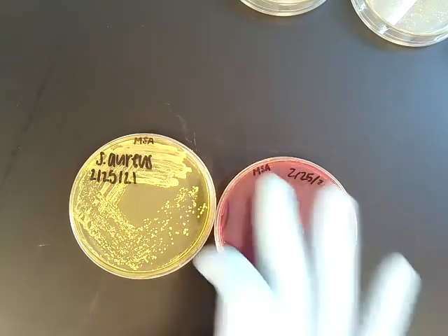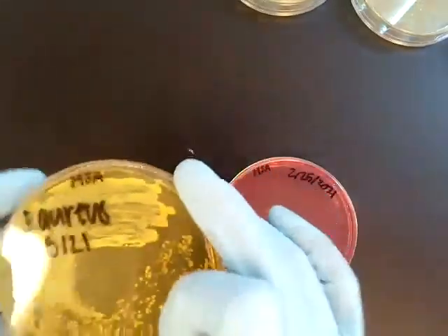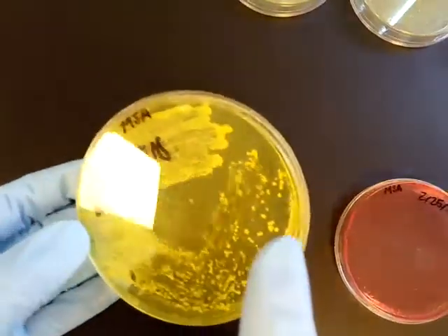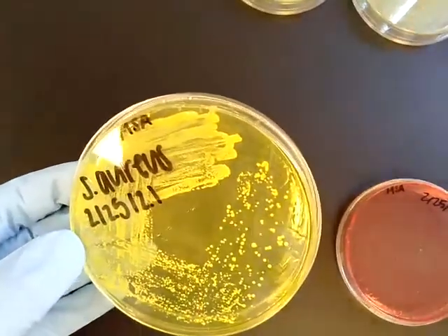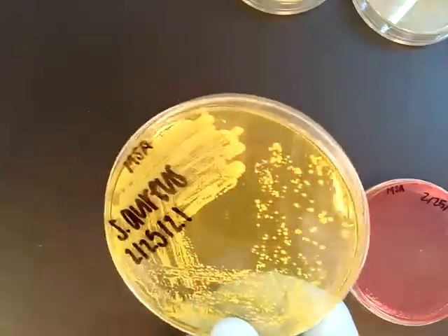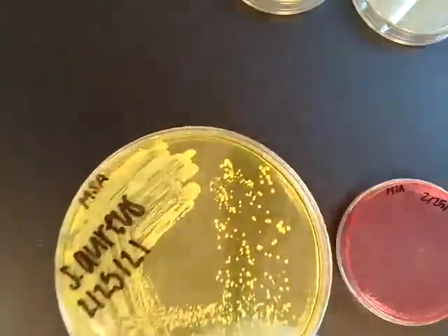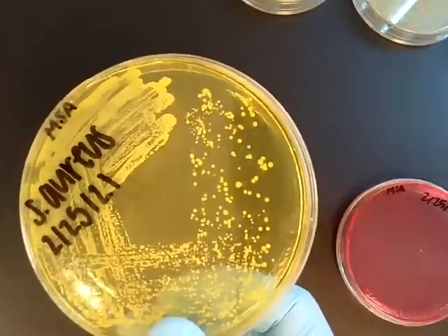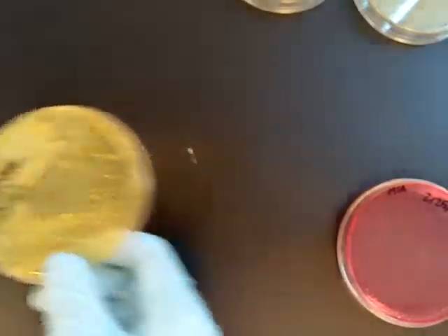So here you can see Staph aureus growing on the plate, and you can see colonies have been isolated. This went through the streak plate method, and we can see perfectly isolated colonies. Staphylococcus aureus turn the plate yellow, which means that it does ferment mannitol, and it's growing on here, which means it can grow in the presence of that high salt concentration.